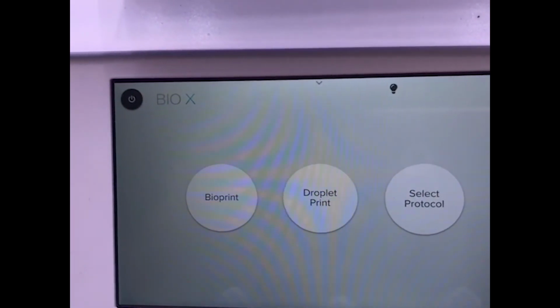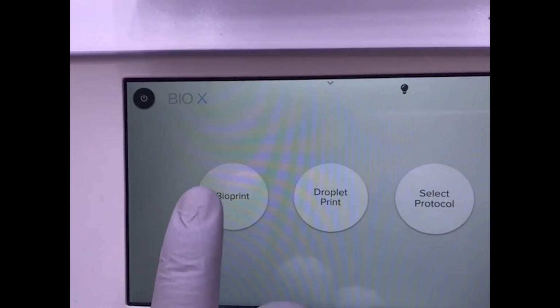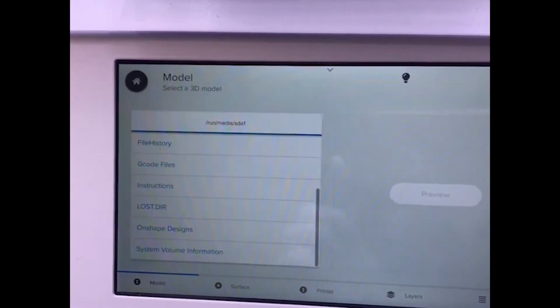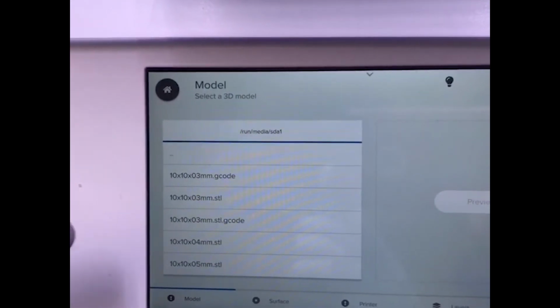And then you have three options that you can do. You can choose bioprinting, where you can actually choose specific files, specific models that you want to print out.